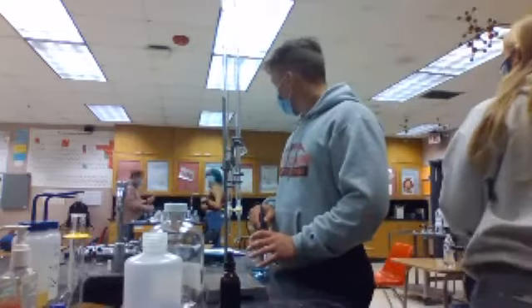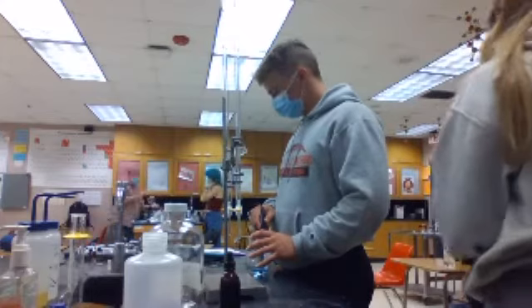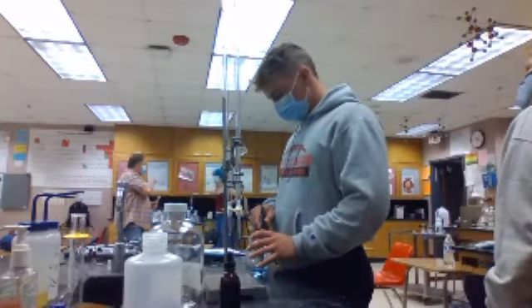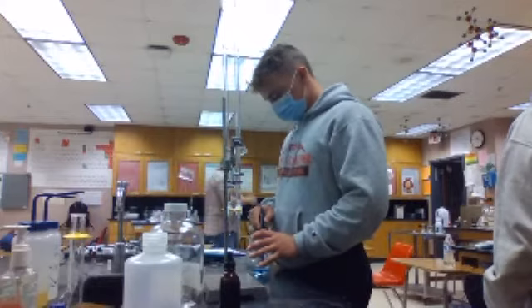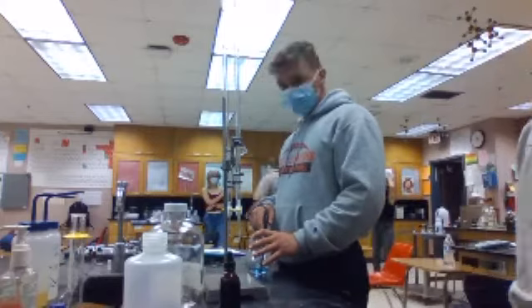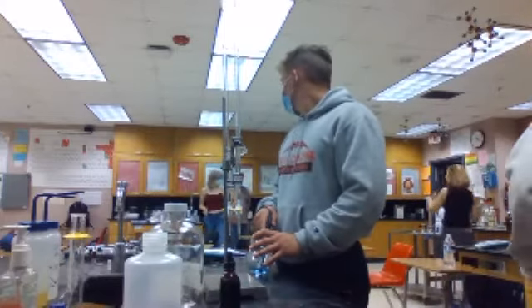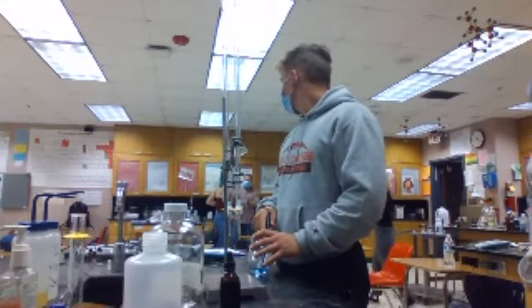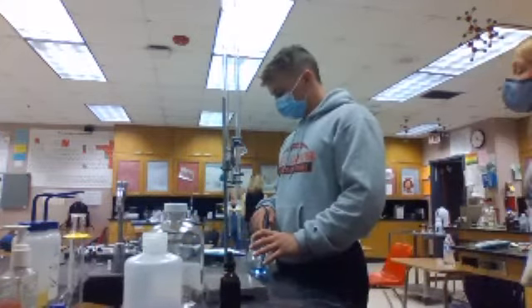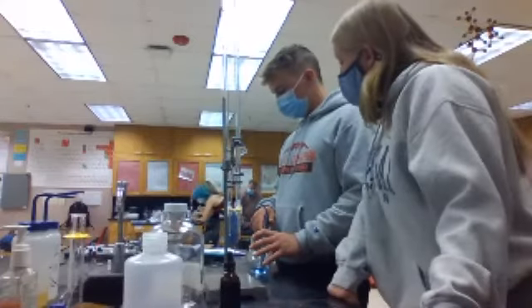So real quick, guys, I need to make a base for that because the base that we have is not powerful enough to neutralize that within one trial. So why don't you guys do your math real quick? It'll take me 10 minutes to make this. Yeah, we need to find the molarity. I think our math is done. You have to find M1 times... You can find the molarity and then average it.